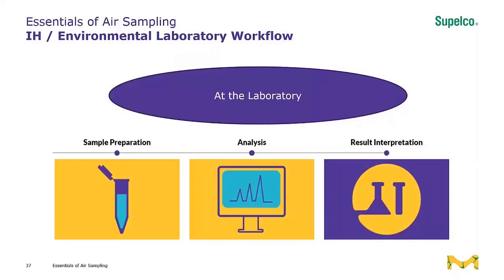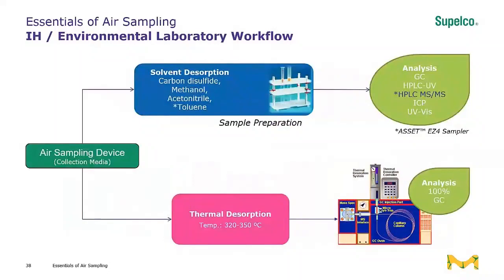And then after sample preparation, the analysis step takes place, and then the results are generated. So that's the workflow in a nutshell. And the previous slide was a more simple version of the laboratory workflow. This is a more expanded version of the workflow.